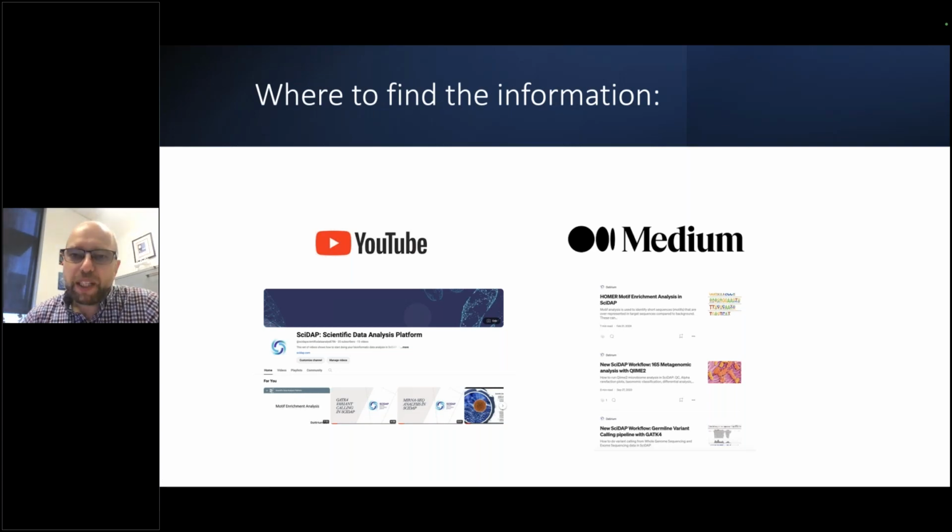Today we will talk about analysis of single-cell data, but as I mentioned, SciDAP can be used to analyze bulk data, and you can find information about how to do it, of course, on our website. But also we have a YouTube channel where we record videos and step-by-step guides on how to do the analysis. Also, we have some discussion on our Medium blog, and you can easily Google for YouTube SciDAP or Medium SciDAP to find them.